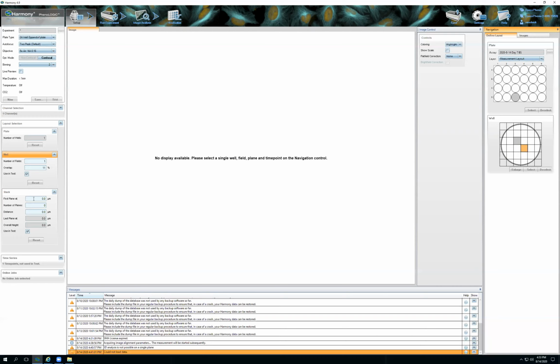I typically start with like -20. And then, the very first time, I select how many microns I need.